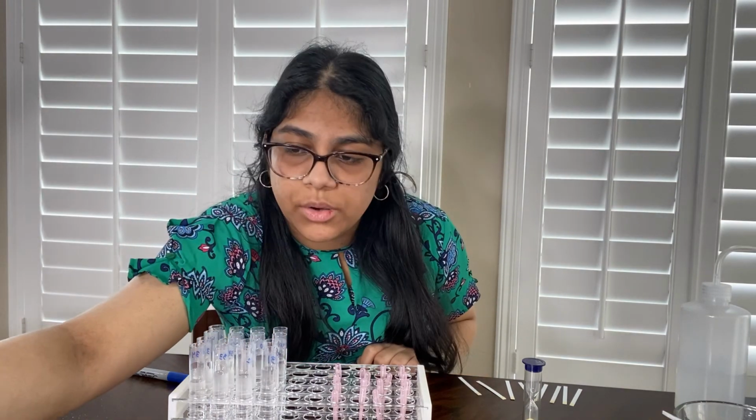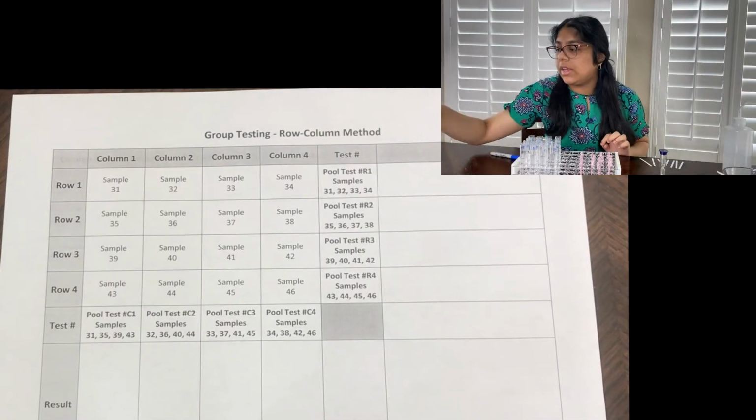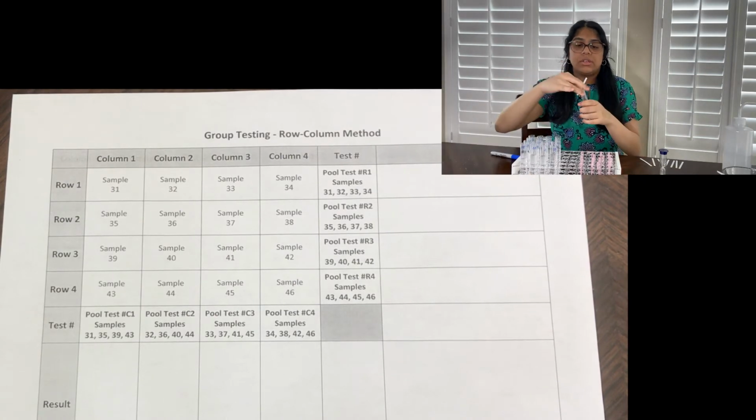All right, so those are all of our 8 pooled tests, and now I'm just going to go ahead and test using a test strip, and then I'll lay them out here on this chart.